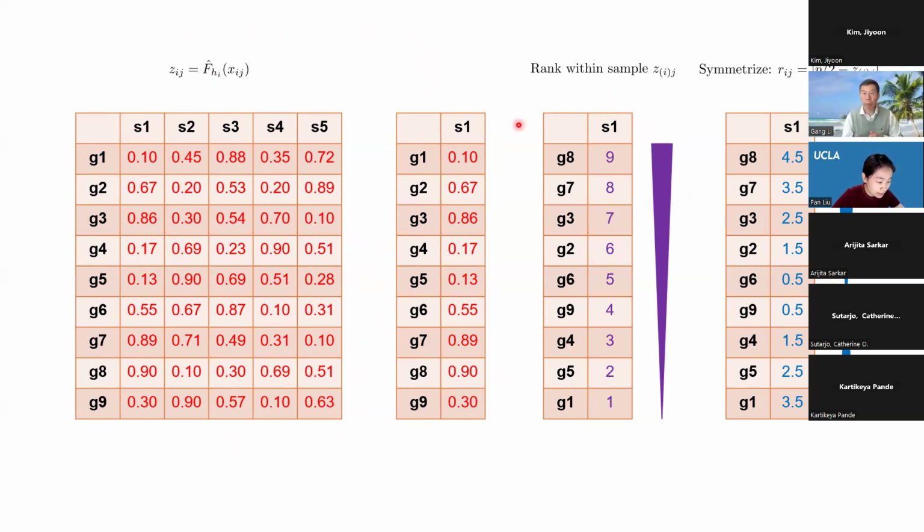What we do is that we rank the genes based on these CDF values. Gene with high relative expression will be put in the front. For example, the G8 here will be put at the first place. So this is the ranked list of the genes, and this is the ranked values from 9 down to 1. Well, actually, starting from this point, it is quite similar to what we have done for the GSEA method, because we only need to deal with this ranked gene list.